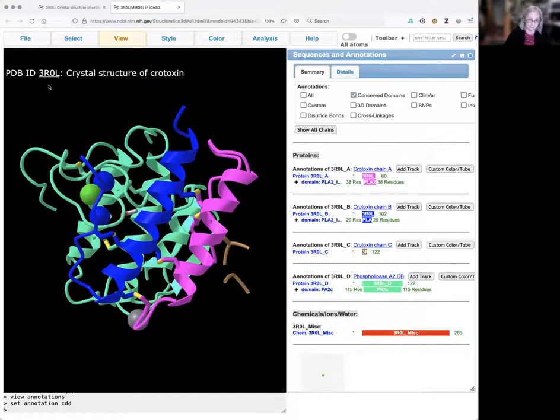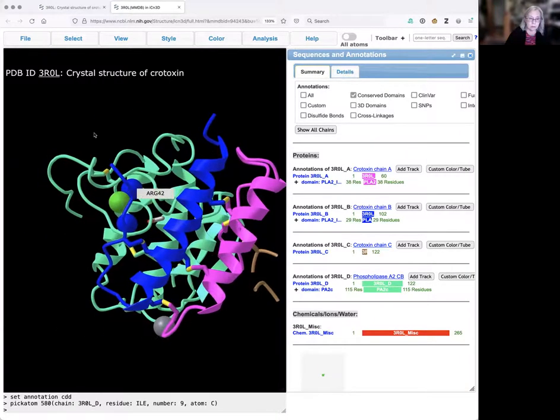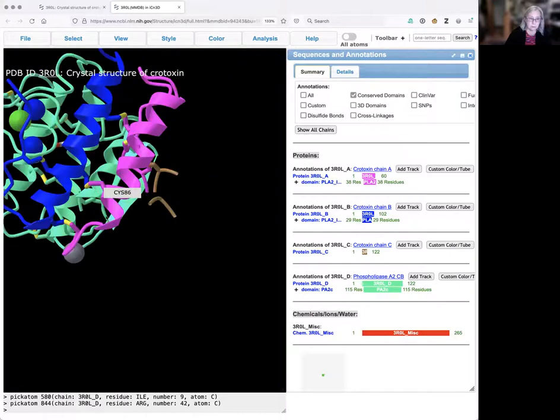So the next thing I want to be able to do is be able to move the structure around. To do this, I hold the control key down and then I can click and I can drag the structure. So that allows me to move it to different parts of the screen.